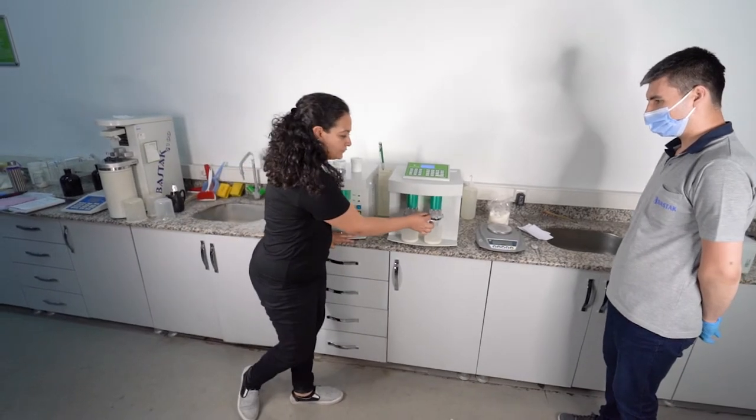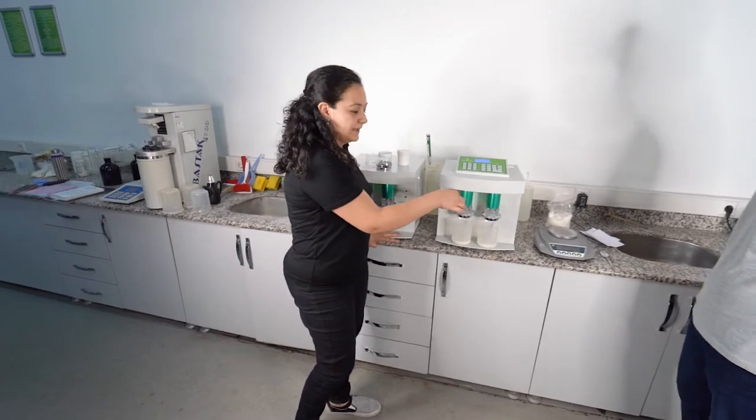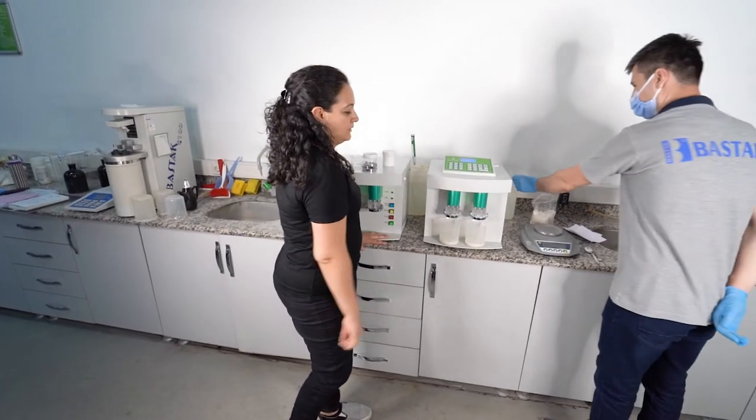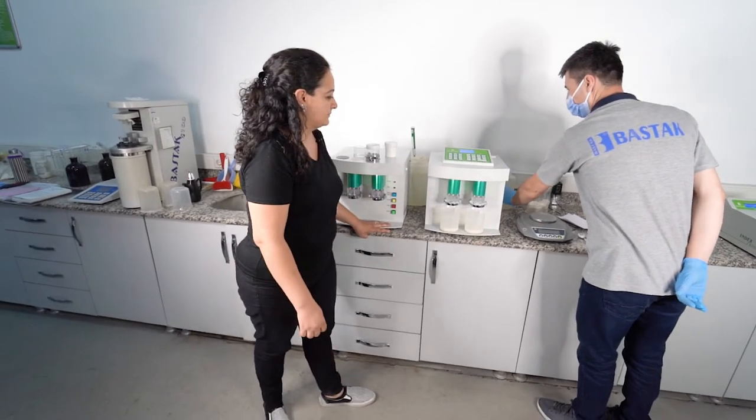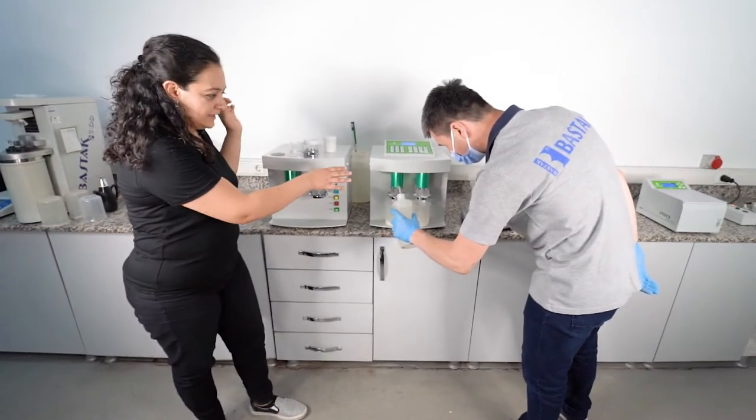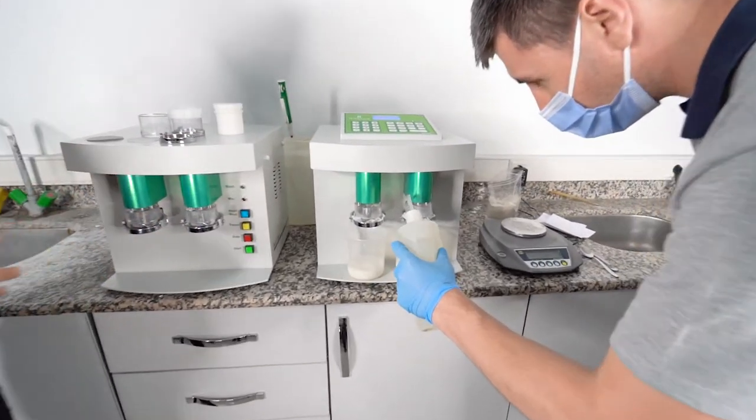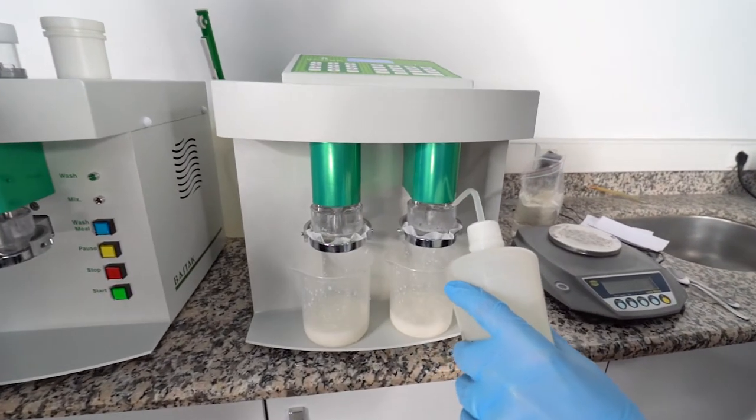If there are some flour particles here, you can add some water and you can remove them through the sample. You should do that step near to the end of the process. You shouldn't affect your result at the first time.